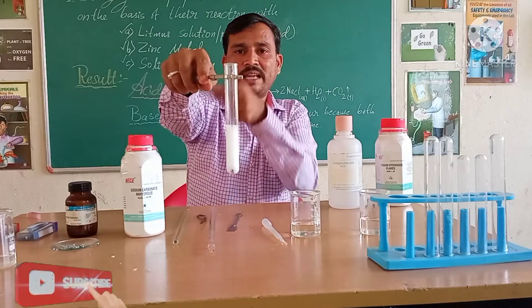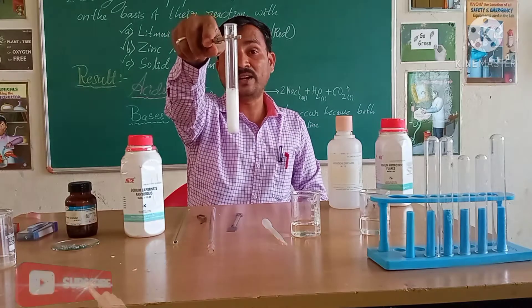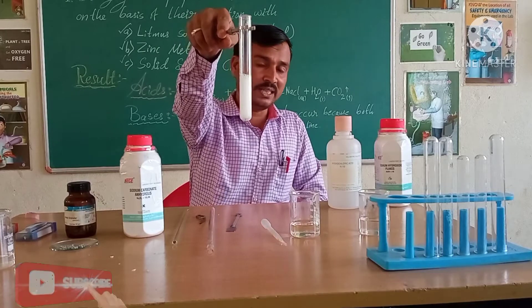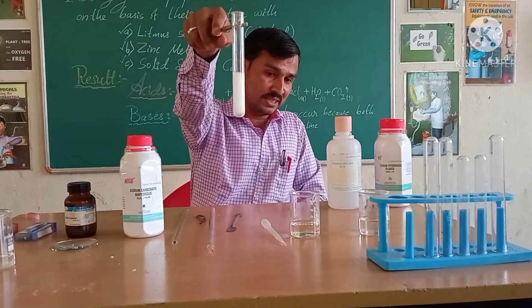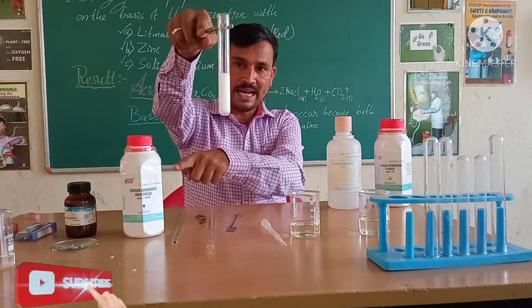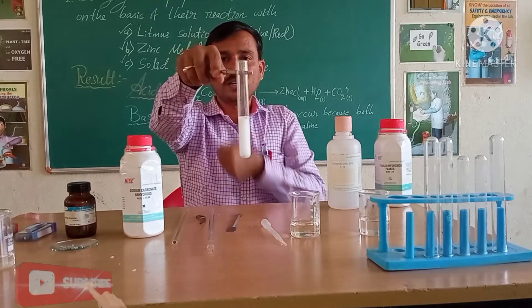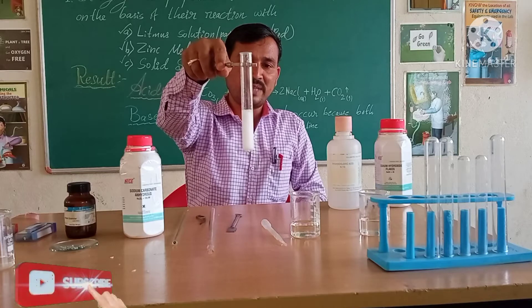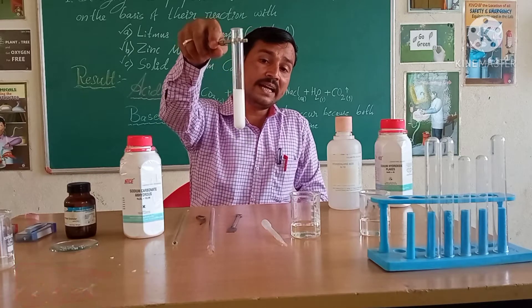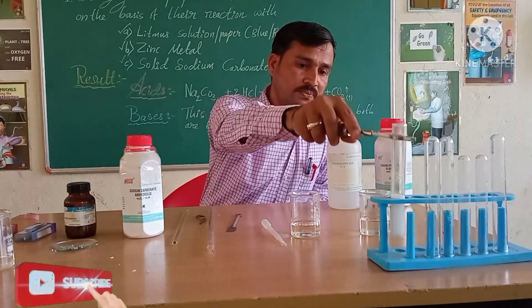Can you see, students? A reaction is occurring here. Gas is being released. Zinc reacting with hydrochloric acid forms hydrogen gas. Acid and zinc granules react — zinc reacts with acid, and you can see gas releasing from the test tube. That gas is hydrogen gas, and inside we will find zinc chloride as the salt.